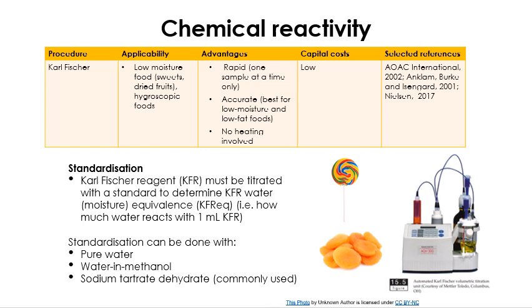Another good thing is that it doesn't involve any heating, and the cost to run this analysis is considerably cheap. In order to run the Karl Fischer analysis, you have to perform standardization, where the Karl Fischer reagent must be titrated with a standard in order to determine the Karl Fischer reagent water equivalence.